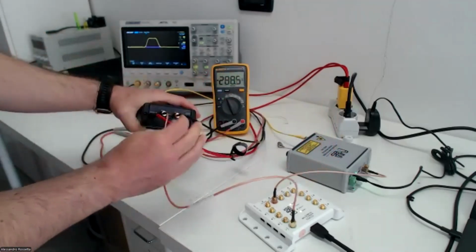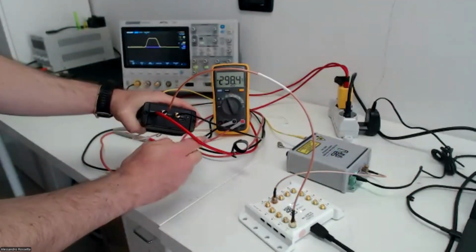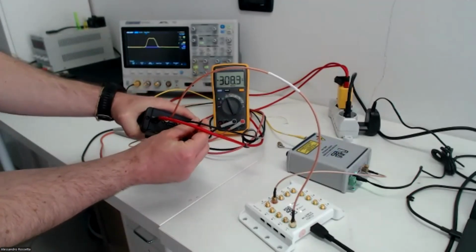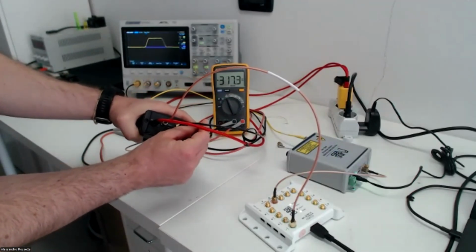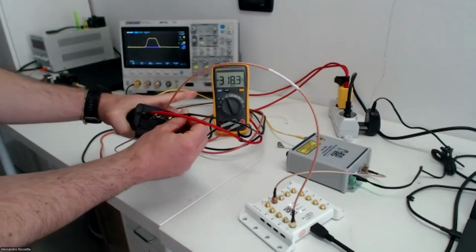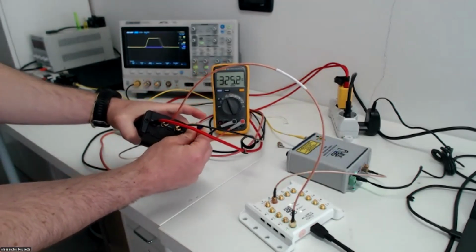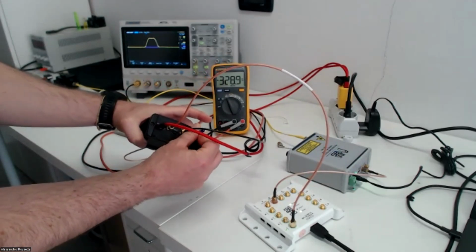So you see here that we have the pulse length potentiometer, and you see that the moment I am twisting this potentiometer, there is an oscilloscope signal in the background that maybe Enrico can show you, while I indicate to you what I am doing. You see, I am twisting this trimmer so that I can change the pulse duration.